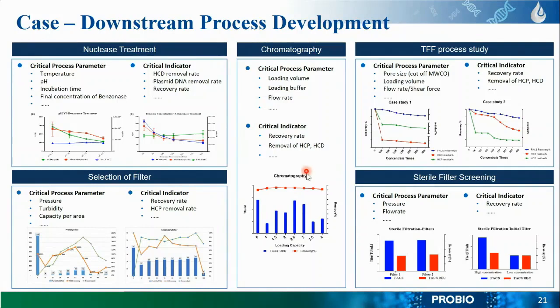And then the ion exchange chromatography technique can be applied depending on the net charge of the particle. For example, if it's LVV or AAV or adenovirus and so on, the net charge and the pH will depend on the particular surface. Most of the viral particles have an isoelectric point below 7.4, negatively charged. Lentivirus is also an example of a viral vector that has been successfully purified using ion exchange chromatography. We have seen it in different companies and our company as well.